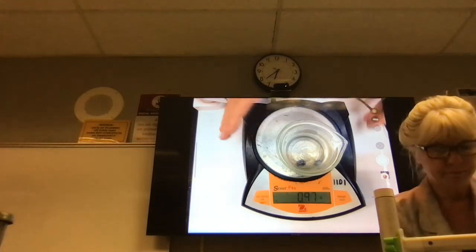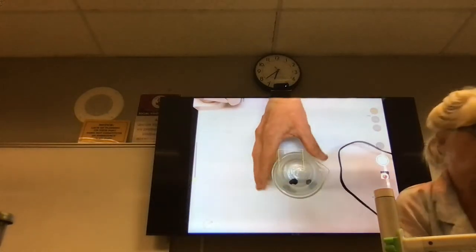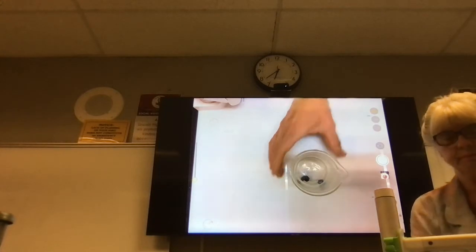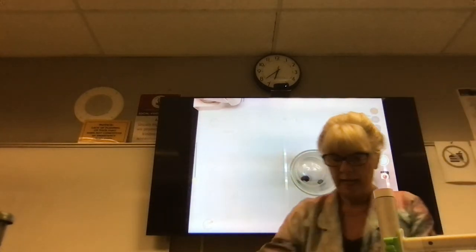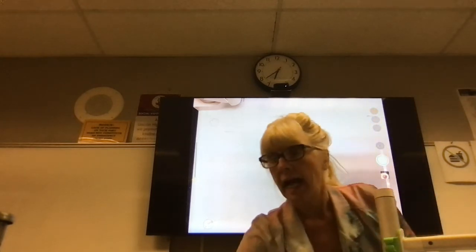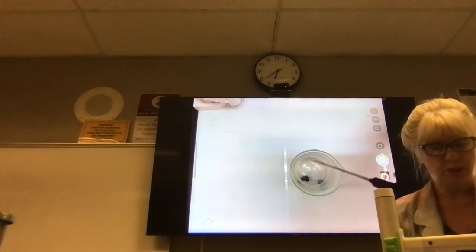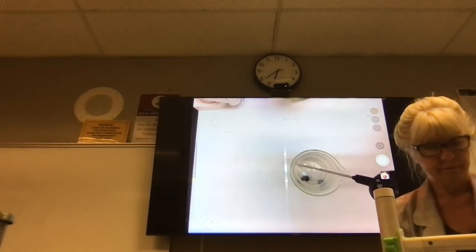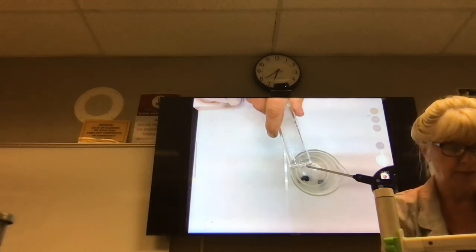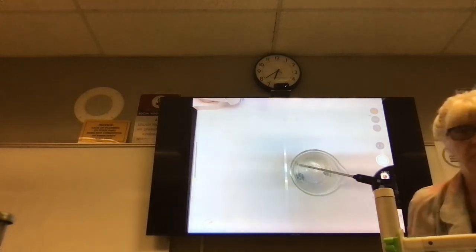So now it says to take it off the balance, and we're going to let it react right here. Okay, and I'm closing up the calcium because it's so reactive. And now I'm going to put the thermometer into the beaker, and it still said 18.6, and now I'm going to add the water to it. And let's observe the reaction.